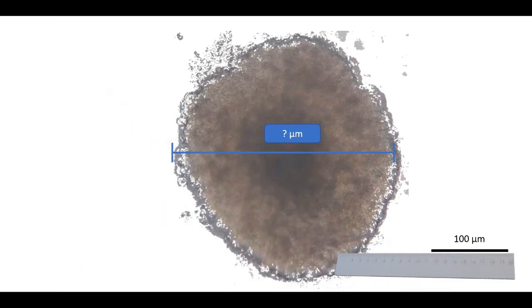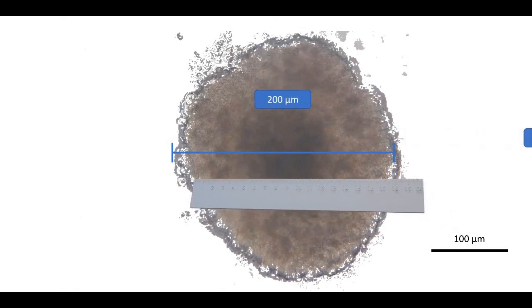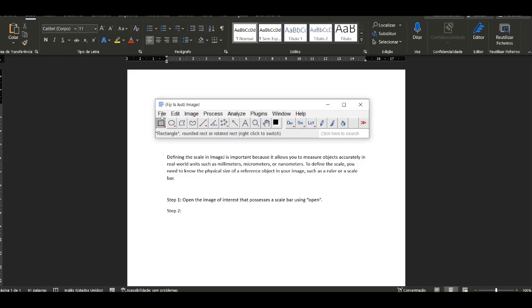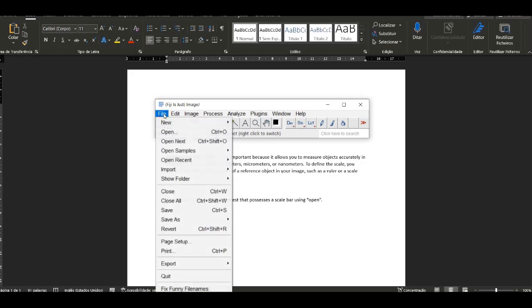To define the scale, you need to know the physical size of a reference object in your image, such as a ruler or a scale bar.